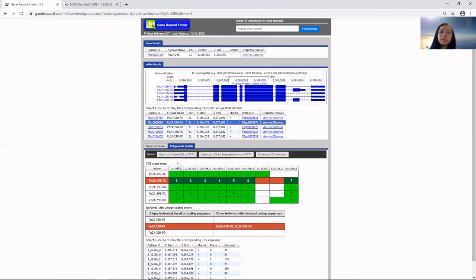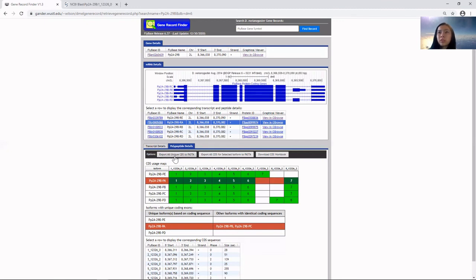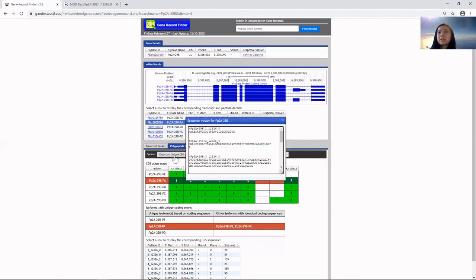To get sequences of all exons regardless of the isoform, click on 'export all unique CDS to FASTA' and you'll get them all here.